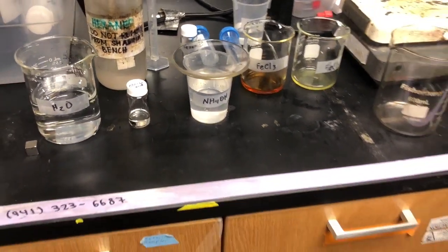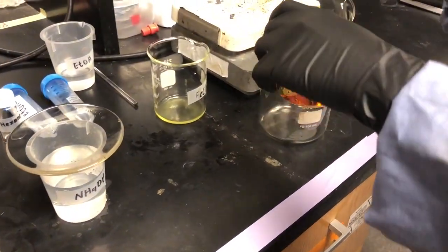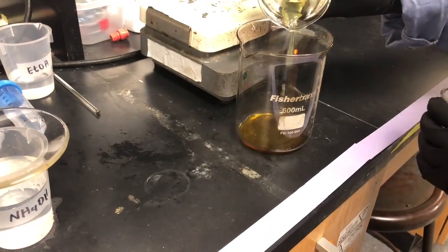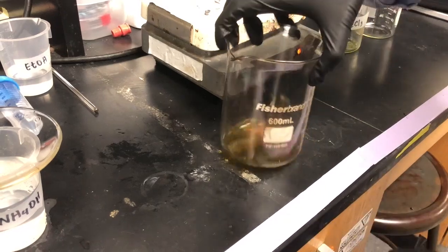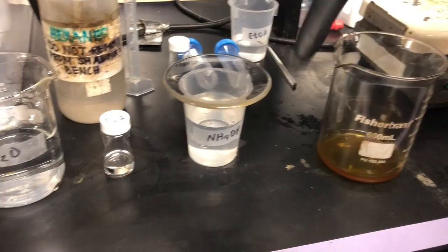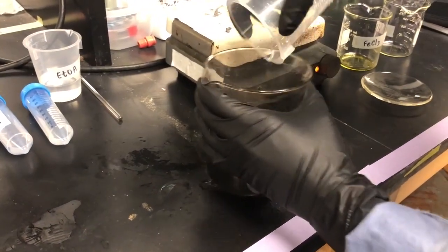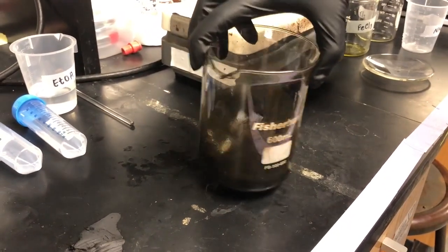All right, let's begin. So first we're going to take the iron chlorides and we're going to combine them, and we will make sure they're fully mixed. Perfect. Next we're going to add the ammonium hydroxide, and we're going to mix that while swirling the beaker. So give me a nice swirl, and you can just dump it in. Immediately you'll see a black precipitate form. Those are our magnetic nanocrystals.